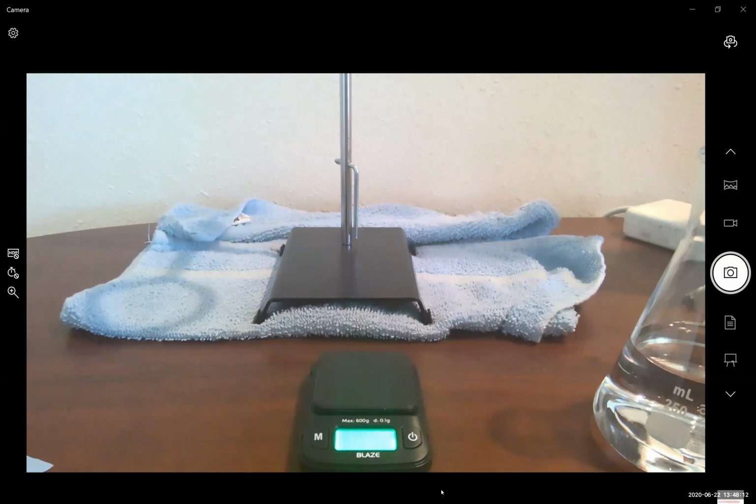Okay, so let's begin today's experiment, which is laboratory 4, the determination of the chemical formula of copper gluconate. First things first, we're going to get on our safety goggles and our gloves, and we're going to get out our portable balance, which you see in front of you. Let me get a pair of gloves on because I don't want to expose myself to any chemical residue.